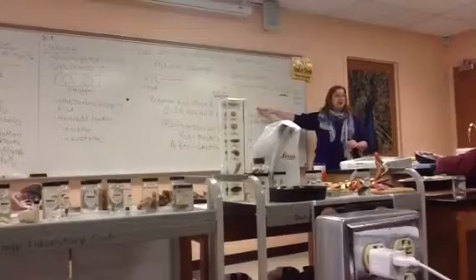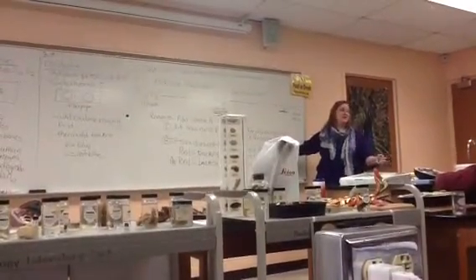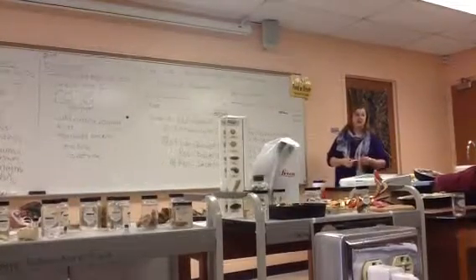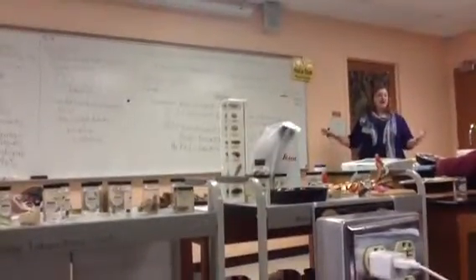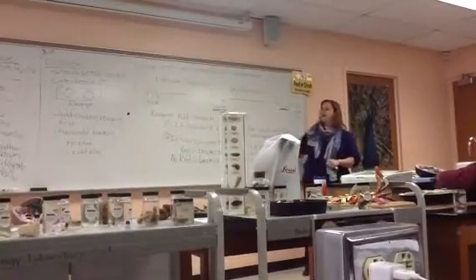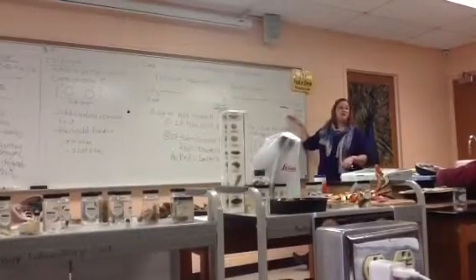All right, so let's just quickly review. We added nitrate A and B, the tube did not turn red. So we add zinc and hydrochloric acid, now the tube does turn red. That tells us that these chemicals converted nitrate to nitrite and not the bacteria. So the bacteria are negative for both nitrate respiration and denitrification. So if the tube never ever turns red, you've now added all four reagents, nitrate A, nitrate B, zinc, hydrochloric acid, and the tube never changes color, that's because the bacteria did both processes. They're positive for nitrate respiration and positive for denitrification.